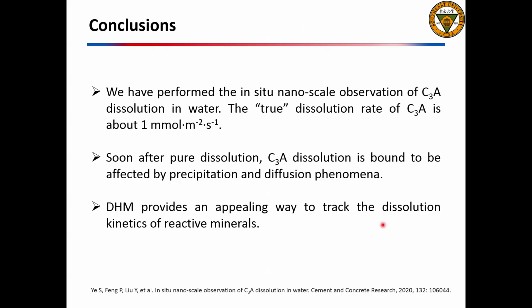So, the following conclusions of C3A dissolution in water can be drawn. I want to emphasize that C3A dissolves rapidly and the true dissolution rate is about 1 millimole per square meter per second.